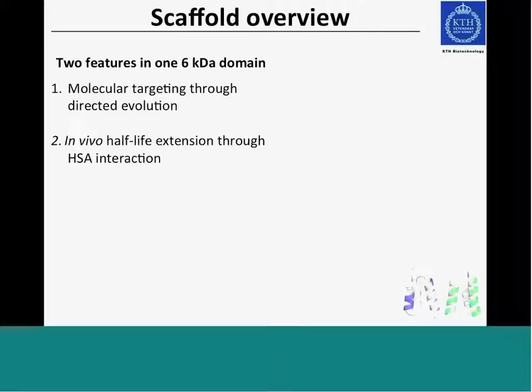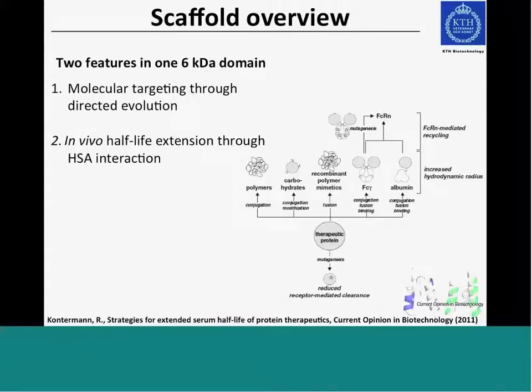The way this works is we have an increased hydrodynamic radius associated with albumin. That is the pathway you are using, and this also enables us to take advantage of recycling through the neonatal receptor, which has been proven very successful by doing all sorts of ABD fusions or HSA fusions.